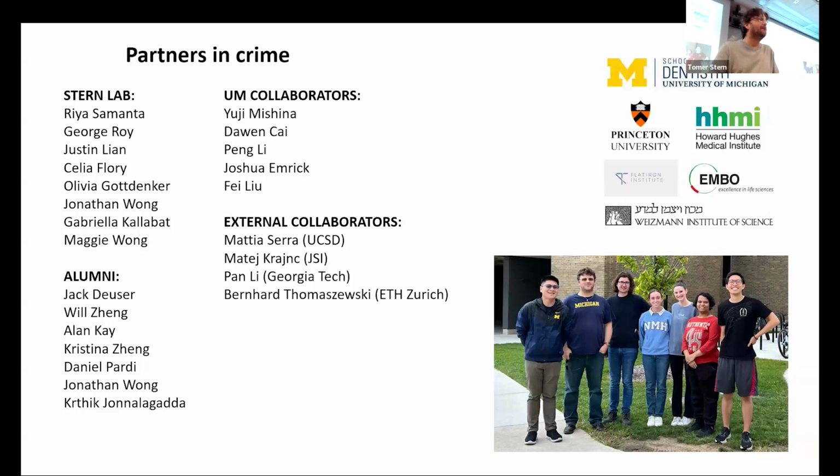I'm also familiar with microscopy, but regarding this method we use with the light sheets, is photosensitivity or phototoxicity ever a concern, or is that not right? It's exactly the opposite. It's absurdly low phototoxicity. I'm imaging flies for the entire day of their embryonic development, and they hatch.